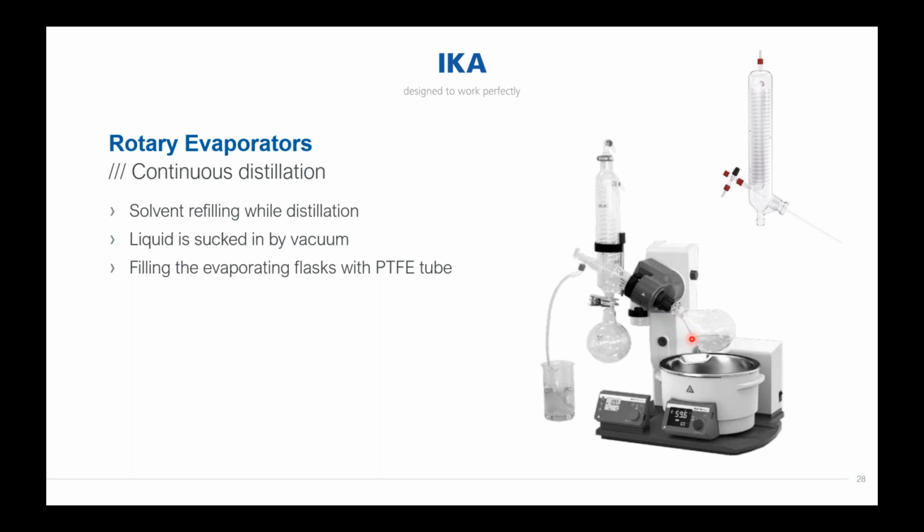So then you can just refill. You don't even need to stop the evaporating process. You can really do it while this evaporating flask is inside the heating bath. And this gives you the possibility to have a semi-continuous distillation.